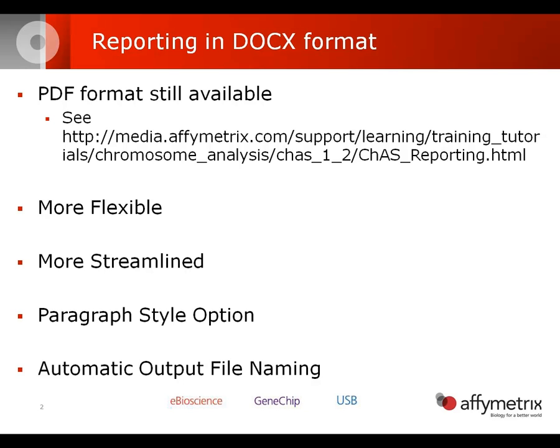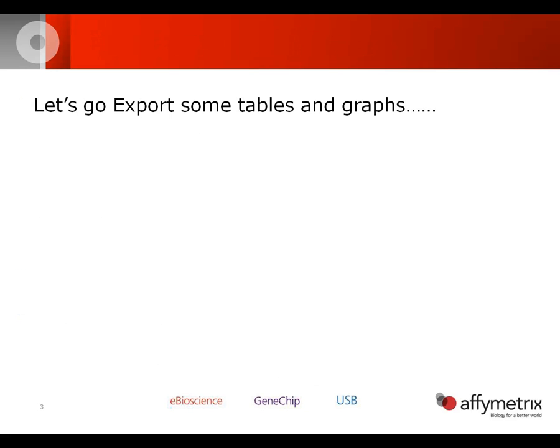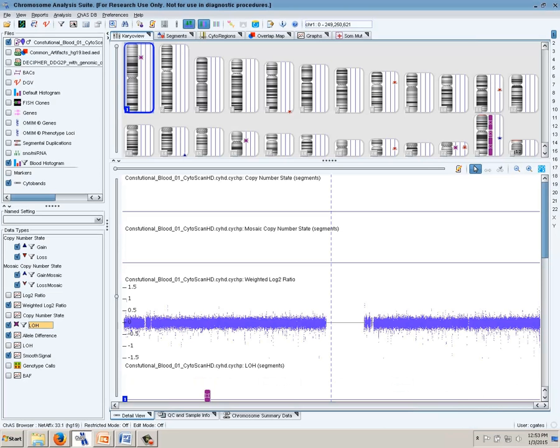So instead of having to type the long CHIP file name, which you may have been doing before, it now will automatically name the report the same name as the CHIP file name. Okay, so let's go ahead and export some of these tables and graphs.